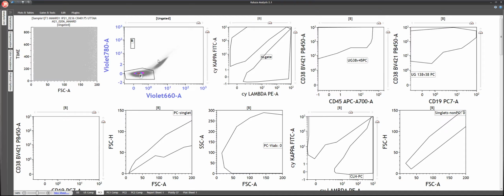Now you characterize the plasma cells, identify whether they are abnormal by antigen expression, or whether they are clonal. Then in MRD, as we have mentioned earlier also, we have to look for other parameters of hemodilution or the bone marrow representation.